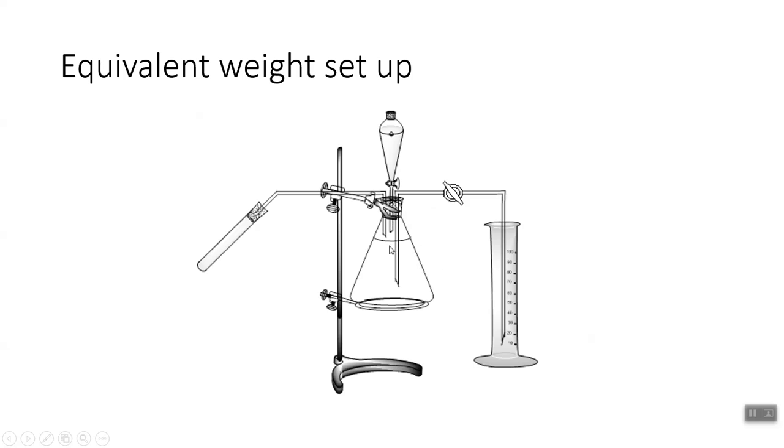And we also measure the temperature and pressure, by equalizing the pressure inside with the atmospheric pressure. We can then determine the mole of hydrogen gas.